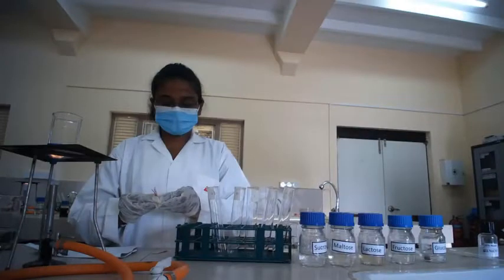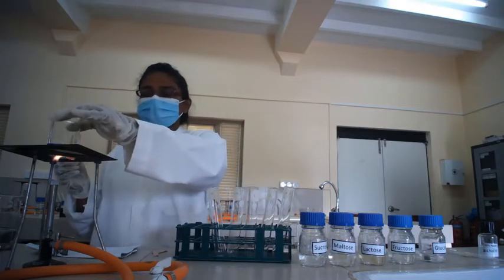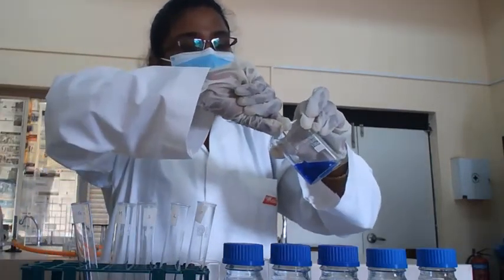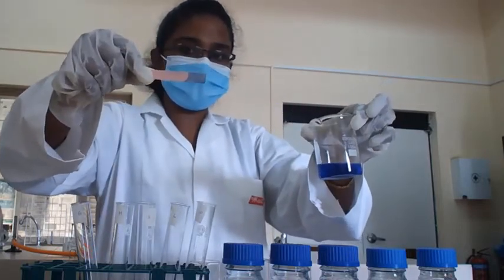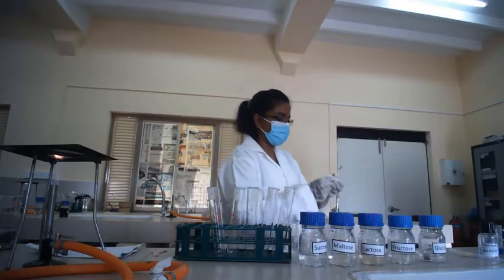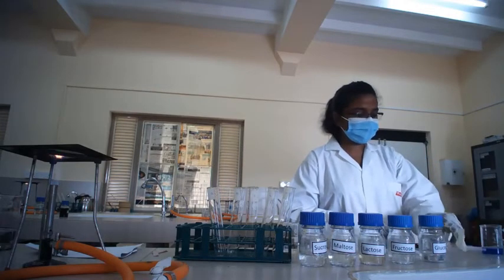Okay, now we need red litmus. We are going to check the Fehling solution with red litmus. When we put in red litmus, it turns into the blue color. So the required amount of basicity is already there, so we don't need to add sodium hydroxide.